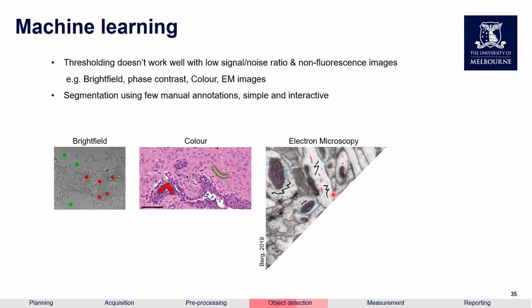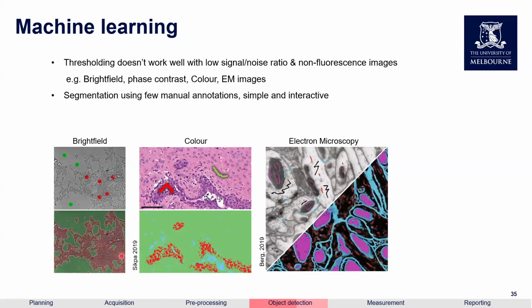Then the software analyzes many different features of these pixels. It's not just looking at the intensity, but it looks at the color, texture, and also the surrounding context by applying many different filters. And then it calculates the category likelihood for each pixel. Then it will generate probability maps and sometimes a labeled image like this.